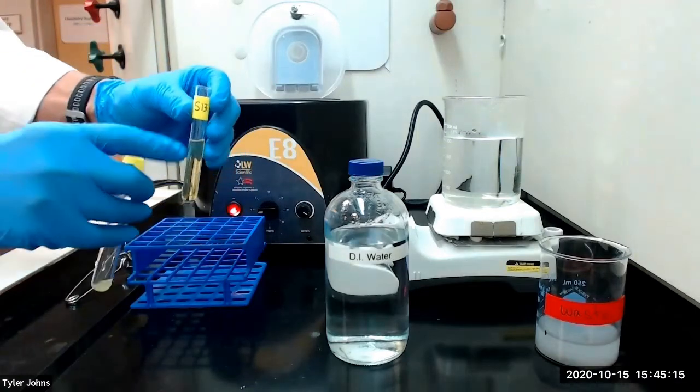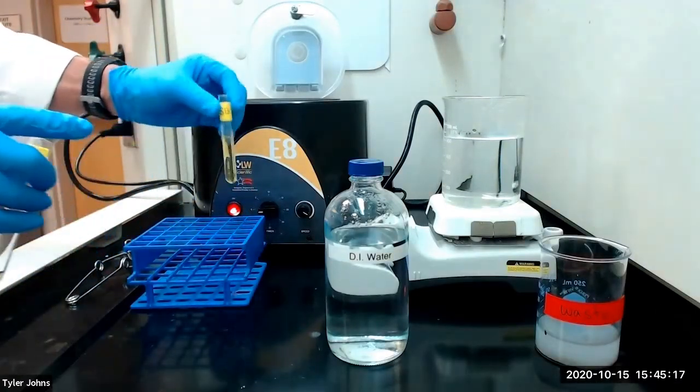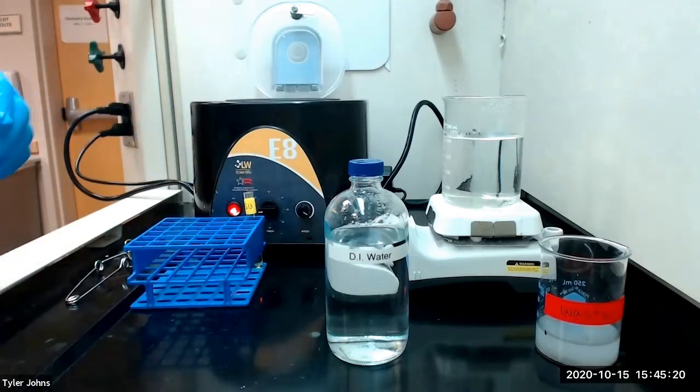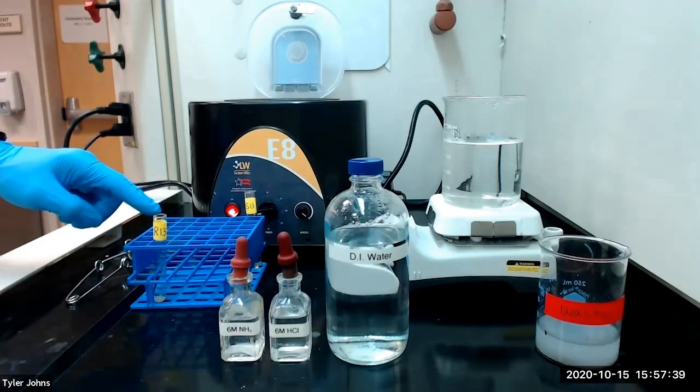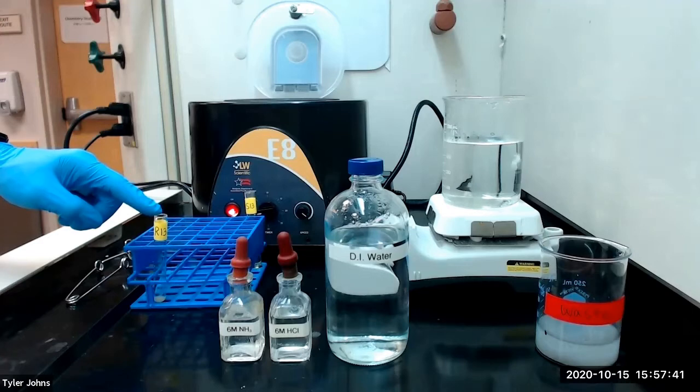We will set solution 13 aside for the chromium test. We've relabeled our residue with the aluminum flocculate as R13 for residue 13.